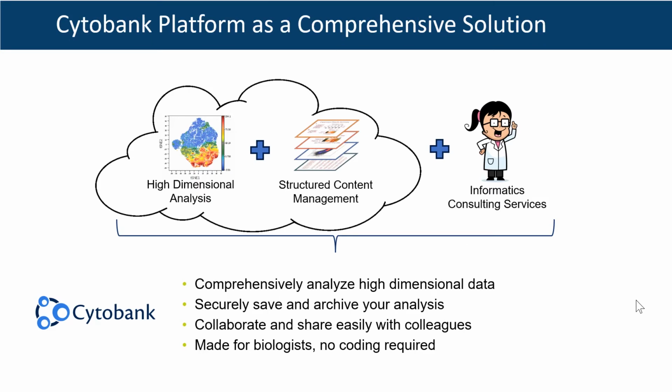And so Cytobank comes in as a comprehensive solution here, because Cytobank is going to be the cloud-based platform that we talked about earlier. You can see that in the cloud space, we do this high dimensional data analysis. What that means is we use the cloud and the resources and the compute power of the cloud to calculate these computational visualizations. The reason why that's important is because these are really resource intensive on your local computer. So sometimes we have to worry about purchasing a supercomputer just to run these algorithms.